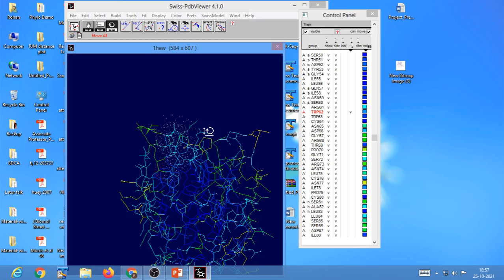In contrast, the solvent accessible surface will lie above each atom at the distance of van der Waals radius plus 1.4 angstrom. And thus, it would include only the surface with which a spherical solvent molecule of radius 1.4 angstrom could come into contact. Therefore, any other part of the surface is hidden from the solvent by surrounding residues.